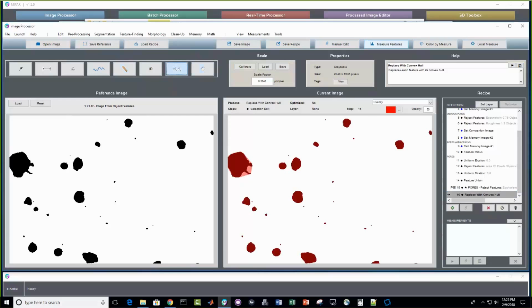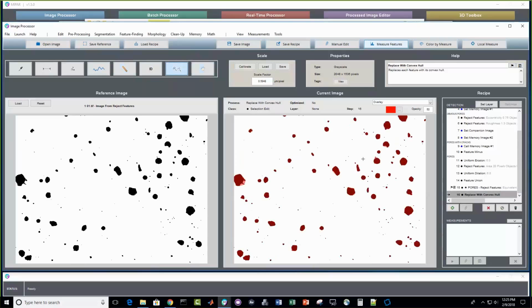And lastly, Jamie asked about the smallest individual size you can detect with the software. That's a great question. We get that quite often, and really there is no size limitation. To us and to the software, pixels are pixels. Ironically, an image of atoms shot with a high-resolution atomic imaging microscope looks very similar to an image of trees shot by a satellite. So there's no intrinsic size limitation to what we can detect.